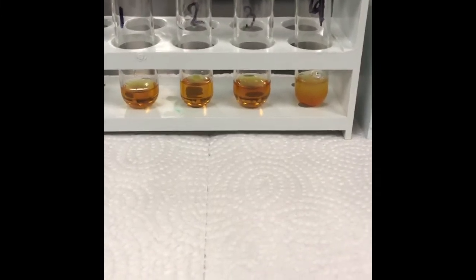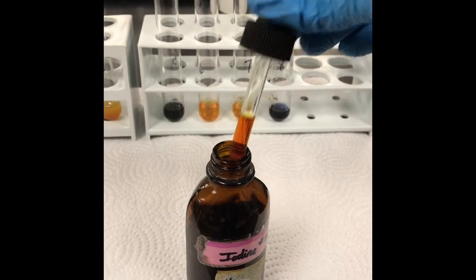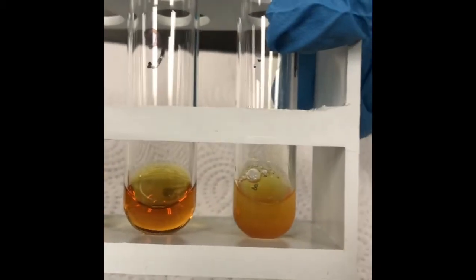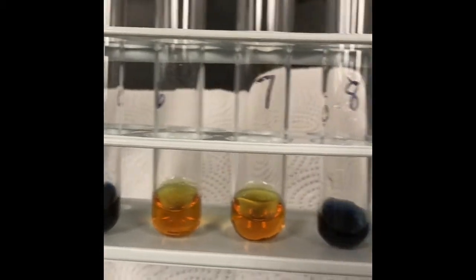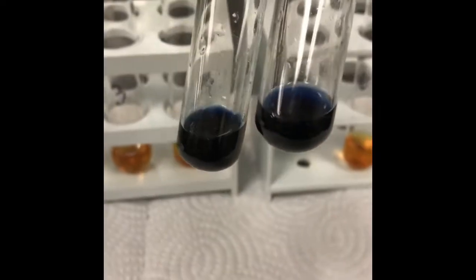Okay, we've added our iodine. You can see tubes 1 through 4. Now just so you know, because the color looks really weird, this is my bottle of iodine, and this is how strong the iodine is. I know some of the substances were different colors, so I will zoom in for you. This is 1 through 4. You're going to note color and then positives versus negatives. Here's 5, 6, 7, and 8. Because you can definitely tell 8 and 5, I'm going to hold them next to each other. If you want to make some comparisons, they both look pretty dark.